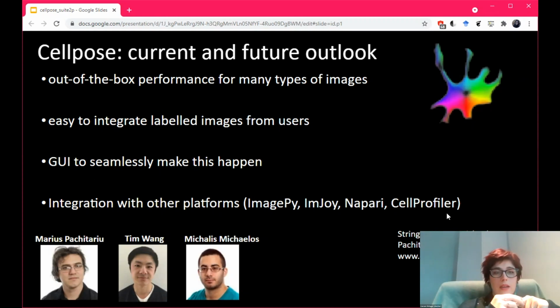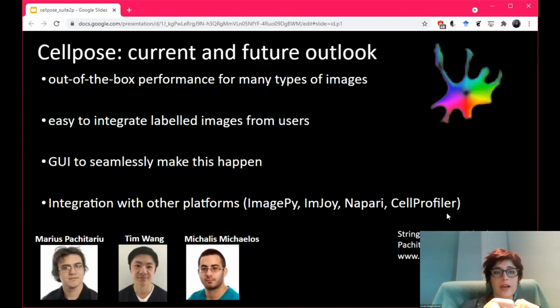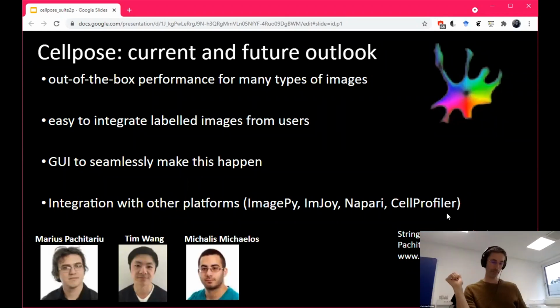It didn't work as well if it had to also learn sizes of objects. But there is a way to automatically estimate size, which uses the inside of the bottom of the U-Net to help predict size. That can also work, but if you know the size, it's even easier to just put the size in. Okay, thanks.